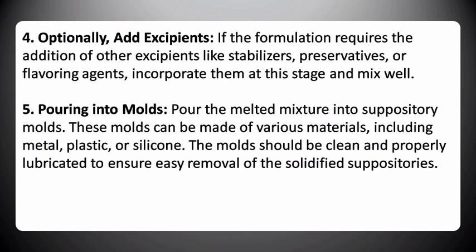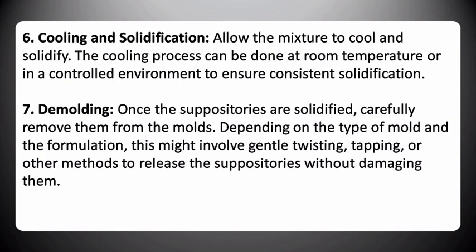Fifth, pouring into molds. Pour the melted mixture into suppository molds. These molds can be made of various materials, including metal, plastic, or silicone. The molds should be clean and properly lubricated to ensure easy removal of the solidified suppositories. Sixth, cooling and solidification. Allow the mixture to cool and solidify. The cooling process can be done at room temperature or in a controlled environment to ensure consistent solidification.